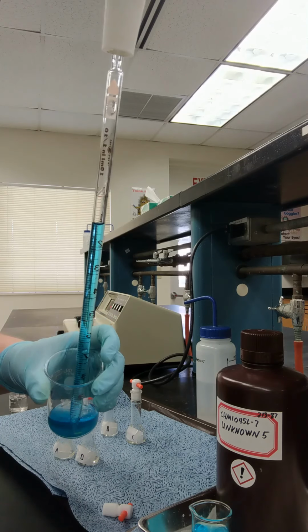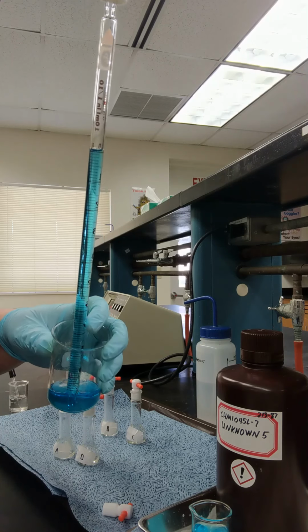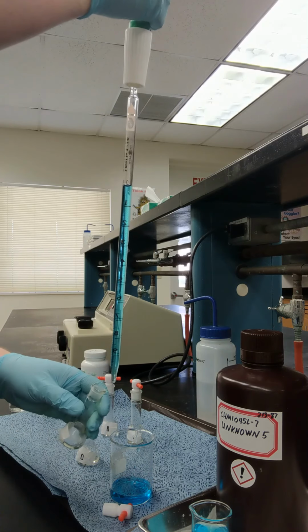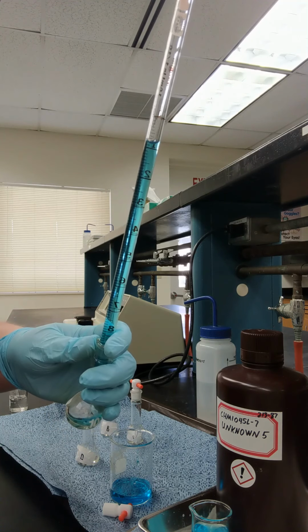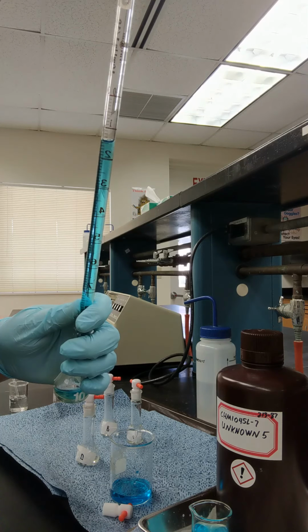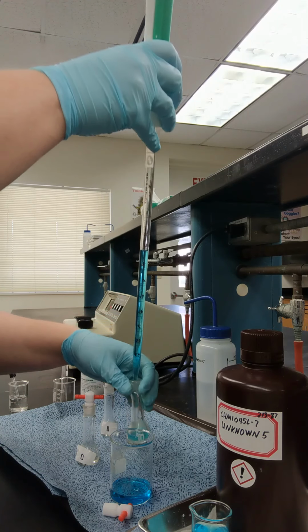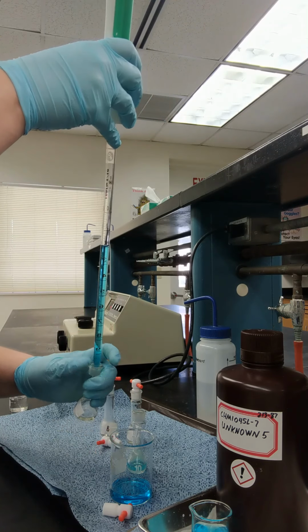So I'm taking in the volume from the beaker using the pipette, and I have it all the way to 0 right there. I'm going to transfer only 2 milliliters into my volumetric flask labeled A. I have right there 2 milliliters, and then the rest will go to my volumetric flask labeled D. That's a total of 10.